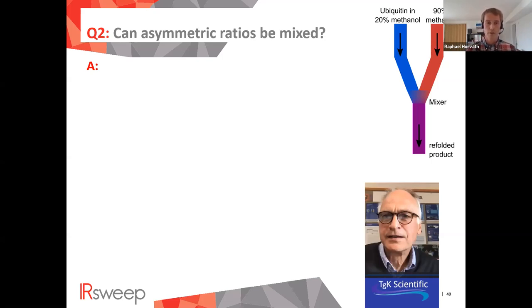The other thing we're looking into in terms of heterogeneous catalysis is to do diffuse reflectance, so measuring more complex catalysts. And I think that can certainly be done, and the detector wouldn't have to be changed. It would just be a matter of changing the geometry in the sample compartment.